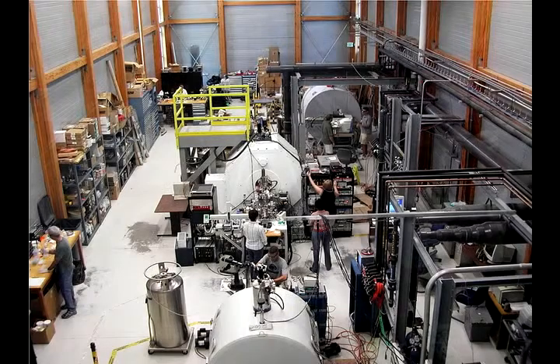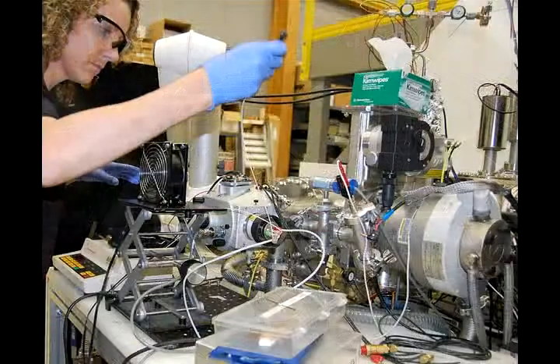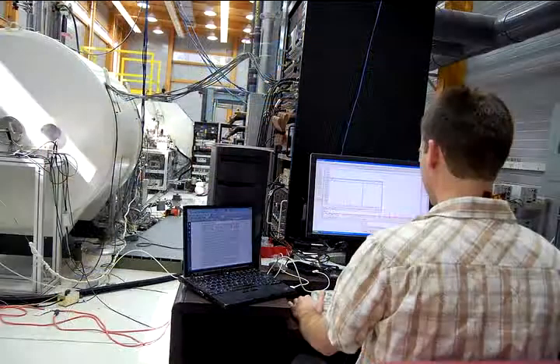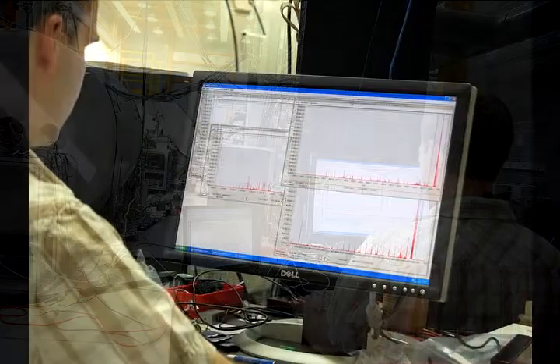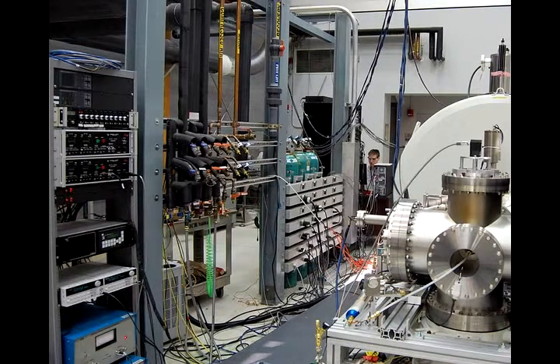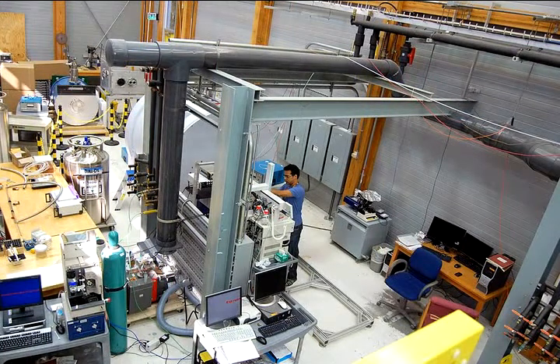You have to put individual molecules into the gas phase, take away all the liquid and solid. We have to generate the signal and detect it. That's all with electronics. We have vacuum pumps to get rid of all the air. We have computers to control everything and then analyze the data afterward. These instruments are the best in the world, not only because of the magnet, but because of all those other parts that we've spent 20 years trying to improve.